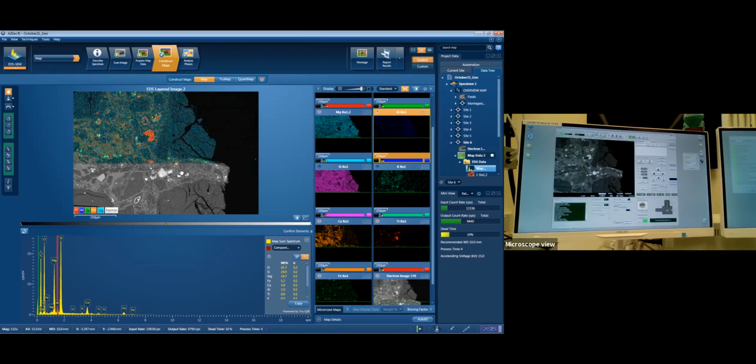This lighter material going through here is much richer in calcium. So you can see it in the calcium map down here. You've got like this dark patch where there's not very much calcium and this big brighter chunk through here where there's much more of it. There's probably some sort of hydrothermal thing would be my first bet.